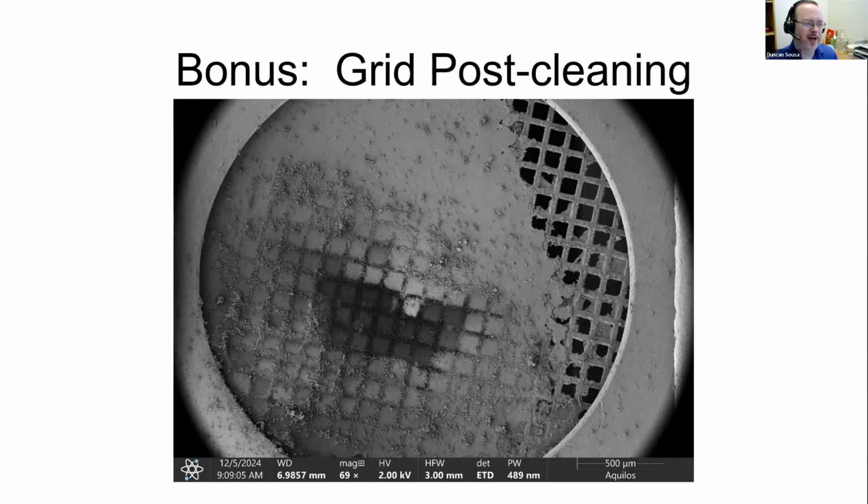The problem here is the grid cleaning. I can help you with the ion trick that we used, because you've got a vacuum in there. Things are not governed by gravity anymore. They're governed more by electrostatic charge. And if you just charge it, which is usually a giant problem in SEM, the charging problem, they'll just fly off. So you can get rid of the stuff that's sort of sitting around, because it will go and find your lamella, because when you're making a lamella, it's charged.